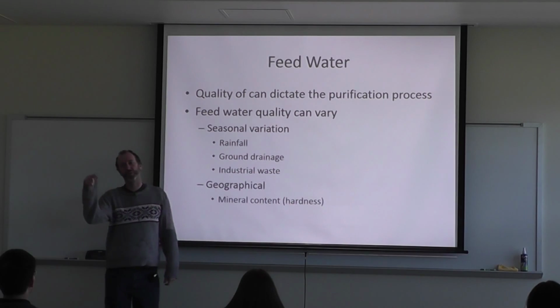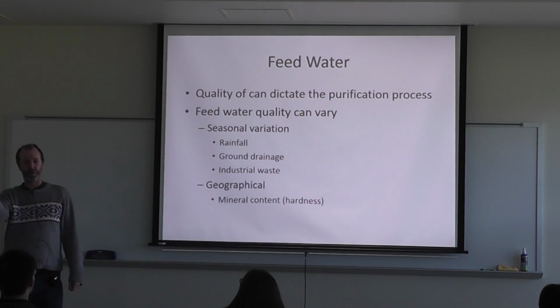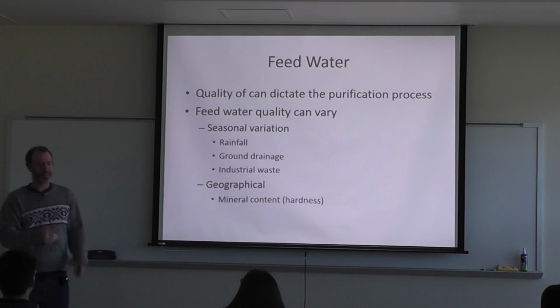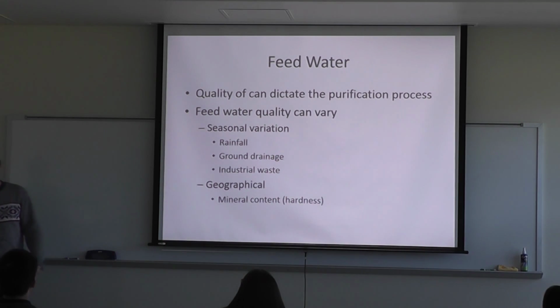The feed water we have for this facility is terrible. It comes straight from the well for the water supply for Alachua, and it's really, really hard. Did you see when we turned on that hot water for the first time? It came out white, and it's terribly bad. The sink in the little fish bowl, the screen on the water always clogs up because of the minerals depositing in that screen.